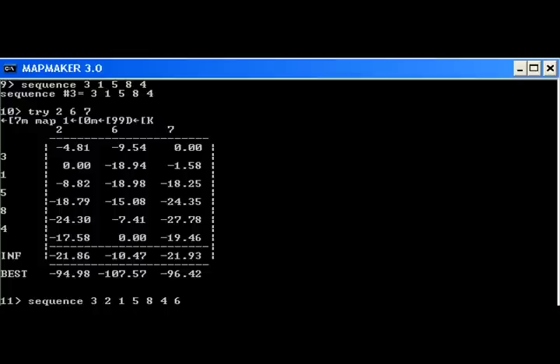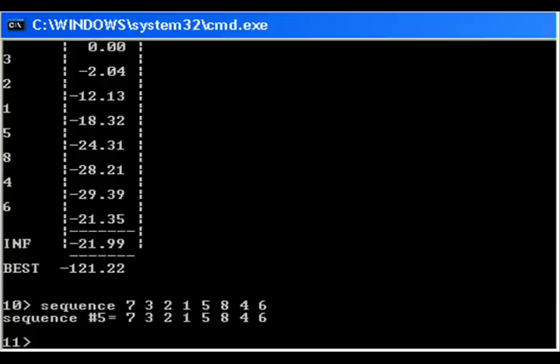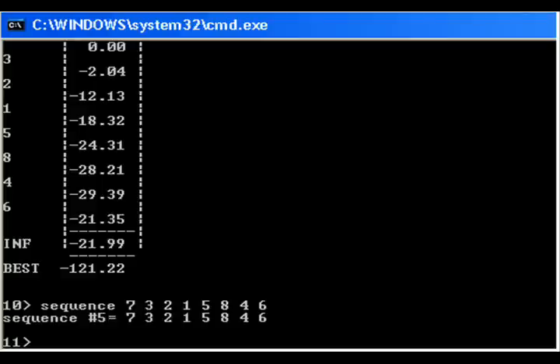Now we set the exact order as 3-2-1-5-8-4-6 using the sequence command. Now the try 7 command tries to place the 7th loci in the map. Finally 7 is placed at the beginning.